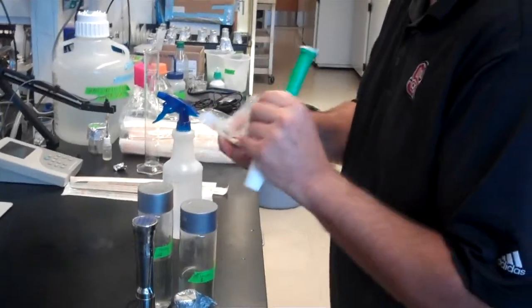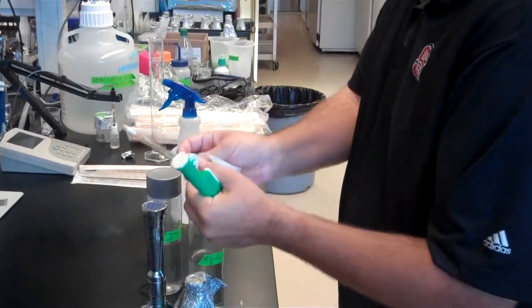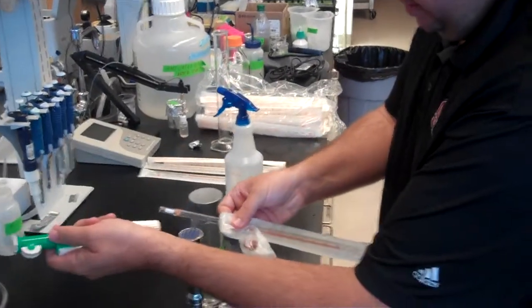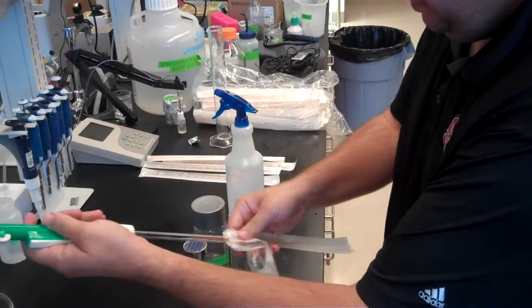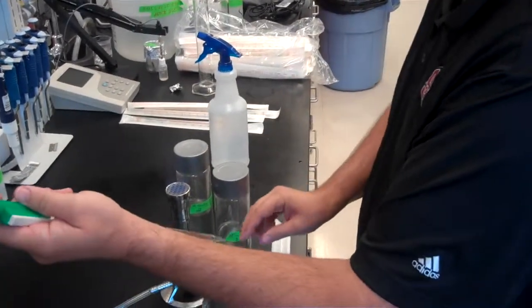Break open the hand crank pump. I'm going to fold these down. I'm trying to keep my hands still in the sterile field. And I want to set this up so that the numbers, as a lefty, I can read them really well. Okay. Now I'm going to leave this right here in front for after I'm done.